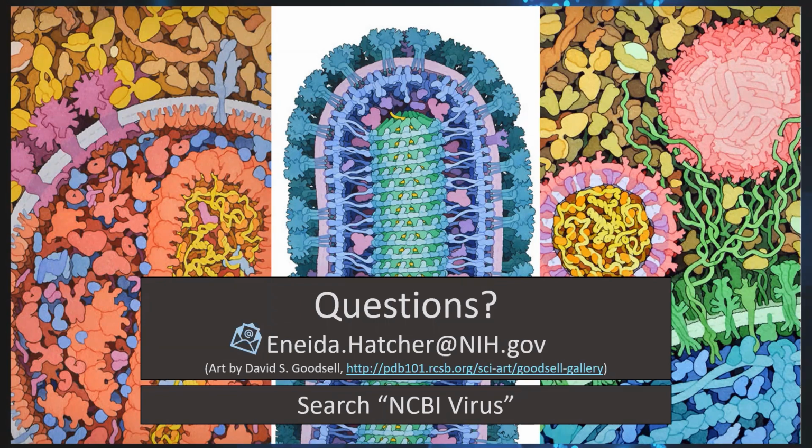That's only for SARS-CoV-2 data or coronavirus genomes, but they have very good explanations of how to use the Datasets tool, either through command line or through API, to access the data. If you have any trouble with it, or if it doesn't satisfy your needs, please reach out to NCBI, because we would love to hear how we can make improvements to our tools.